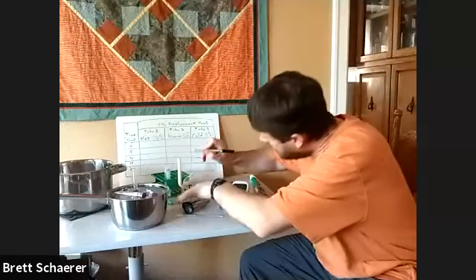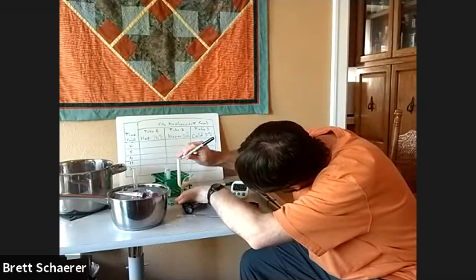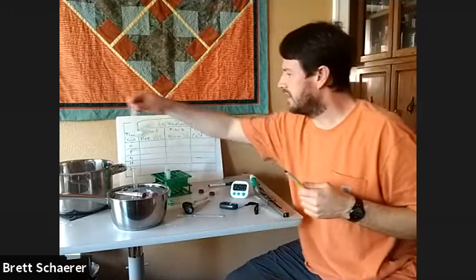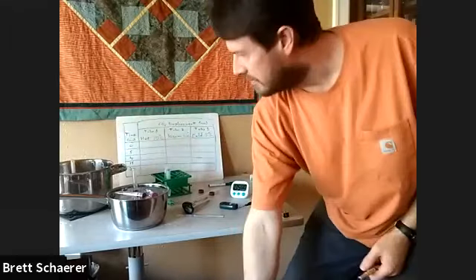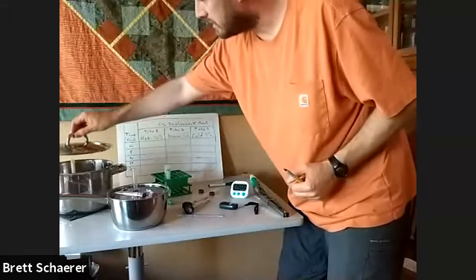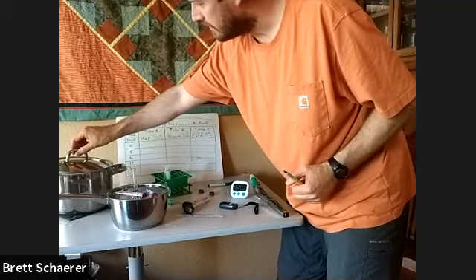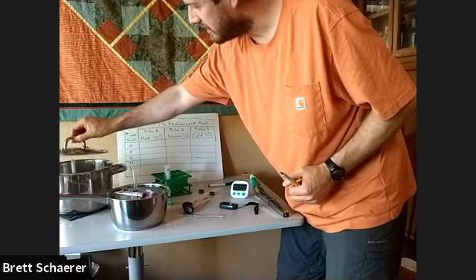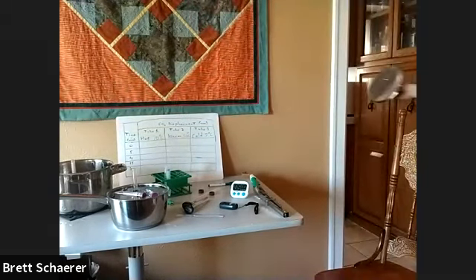Okay. Put this back in the hot environment. Make sure the yeast is not going to spill. I'm going to leave the lid off because that looks like it's going to spill. Or put the fermentation tube over. Okay.